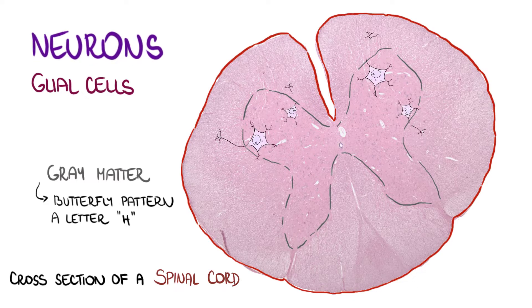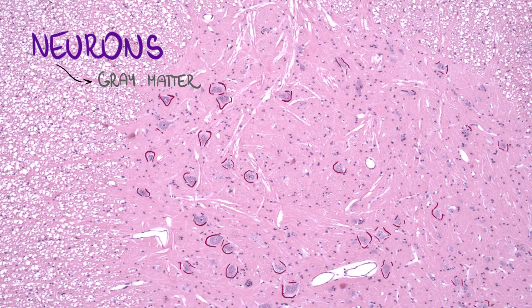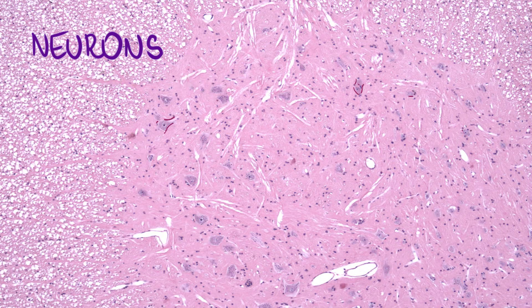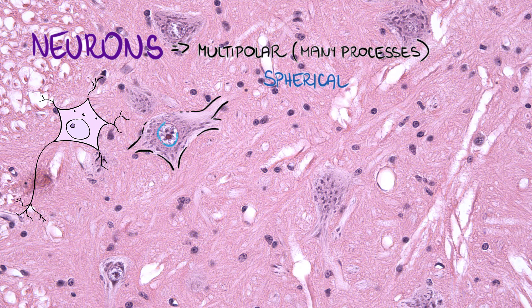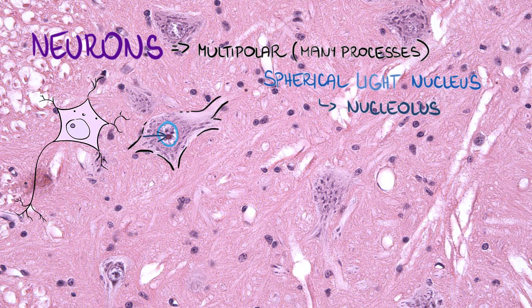Neurons can be found in gray matter only. They are multipolar, which means that they have many processes. A spherical, ovoid, light-active nucleus with nucleolus is typical, because neurons are very active cells in terms of production.